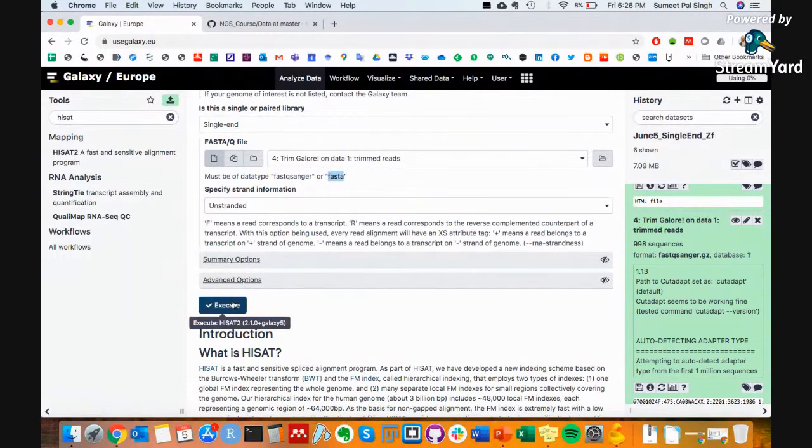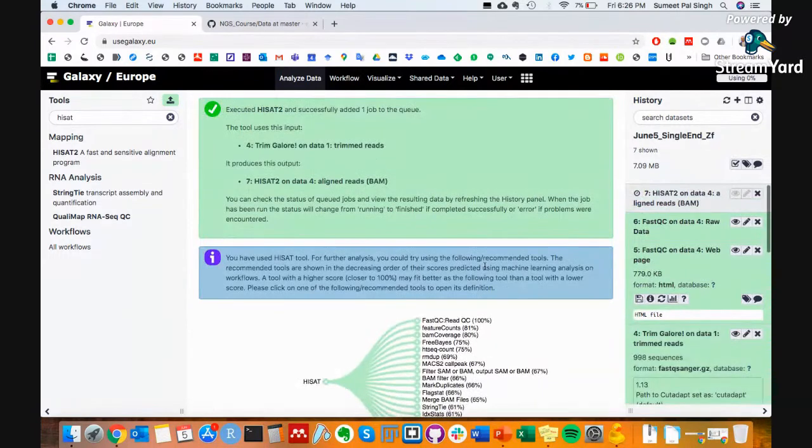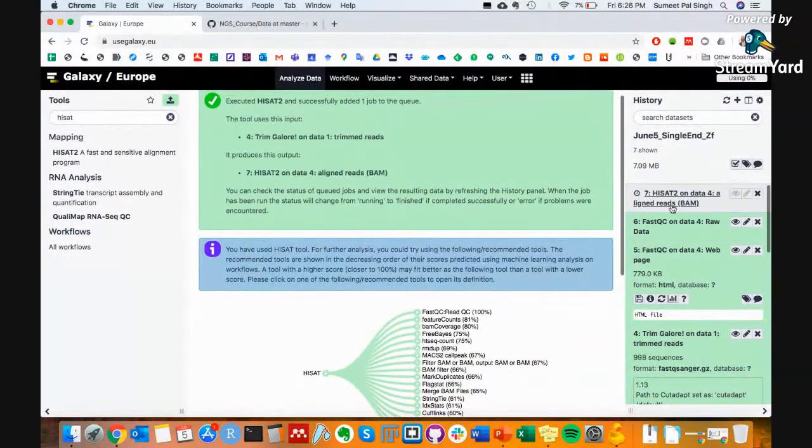And then you just say execute. If you do not know, you can put unstranded. It's not a big problem. And then you just execute it, right?